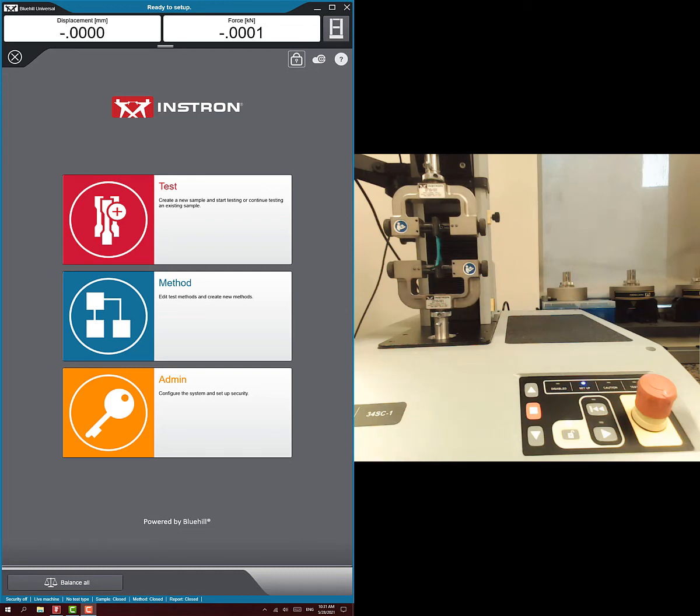Hi everybody. I've shown you how to do a normal tension test and a stress relaxation test. The last test I want to show you how to do is a hysteresis test. It's a little bit different setup, but you basically do the same thing. We're going to set up a method, then run the test, using a finger of a rubber glove as our example.